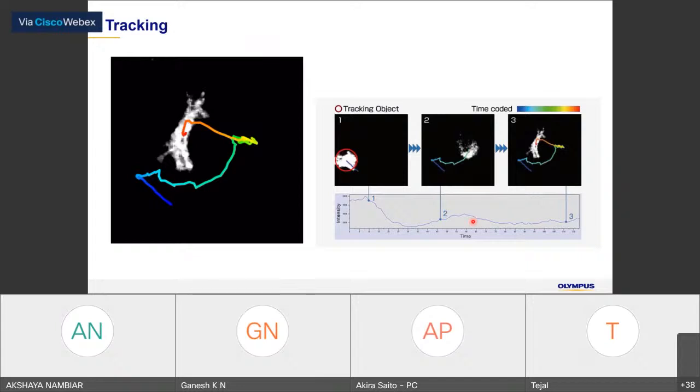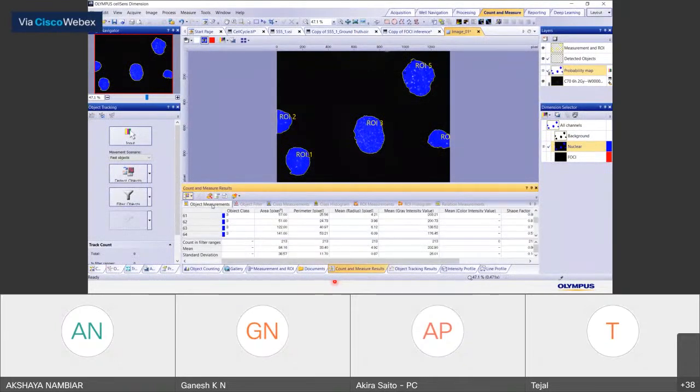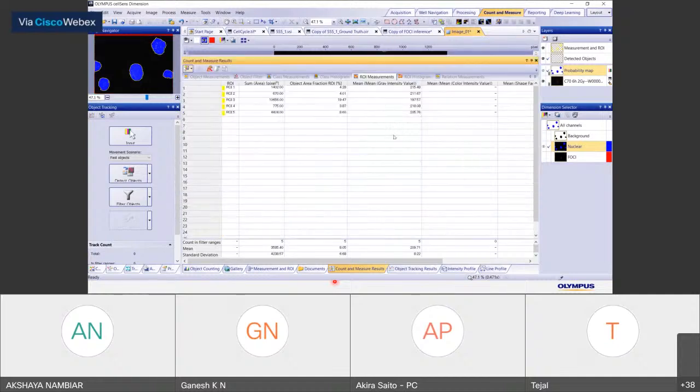So will we take the average of each ROI or itself in the final result? The average of each ROI. Okay. So in our count and measure result window, we can have each parameter's information over here.